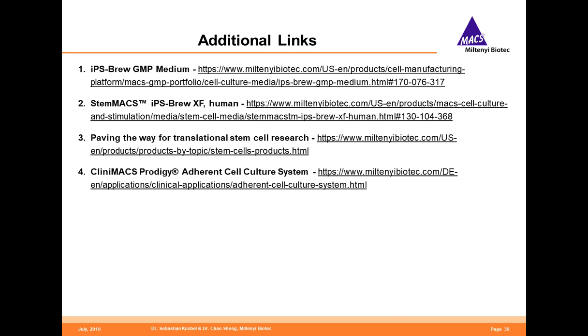Great, thank you. Your next question is, what are the scales of PSC and MSC manufacturing in the CliniMACS Prodigy Adherent Cell Culture System?